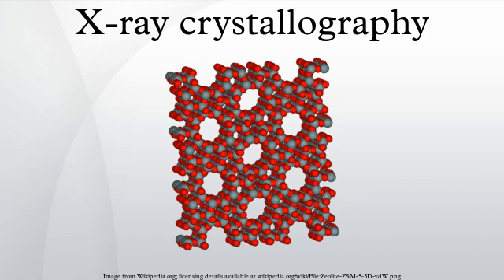The most popular method of incorporating anomalous scattering atoms into proteins is to express the protein in a methionine auxotroph in a media rich in selenomethionine, which contains selenium atoms. A MAD experiment can then be conducted around the absorption edge, which should then yield the position of any methionine residues within the protein, providing initial phases.